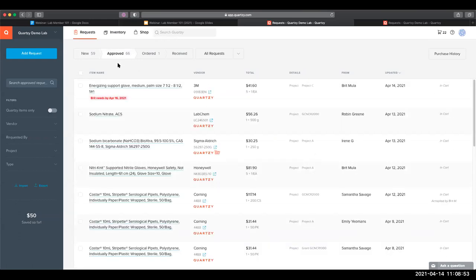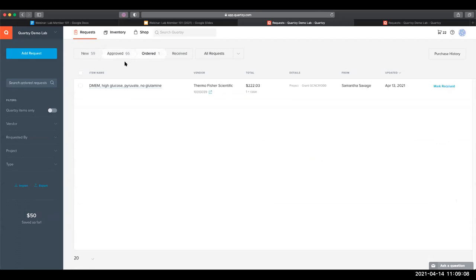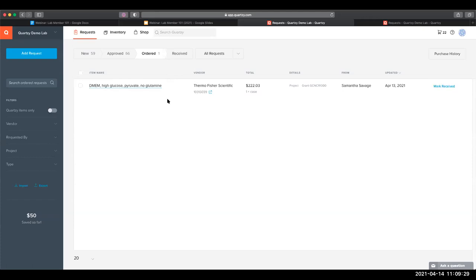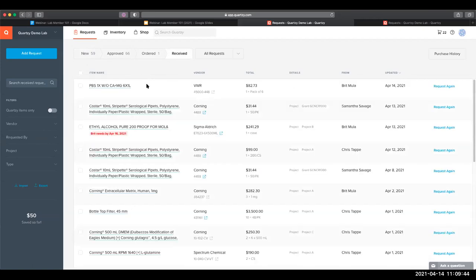The Approve tab lists the requests that an admin has approved and plans to purchase but has not yet placed an order for. If your lab doesn't have an approval set up, you won't see this tab. The Order tab lists items that have been ordered and are waiting to be received by the lab. Once they've been received, someone in the lab should mark that request as received in Quartsy. Note that anyone in the lab, member or admin, can mark a request as received and simultaneously add it to the inventory. The only role that can mark a request as approved or ordered is an admin.